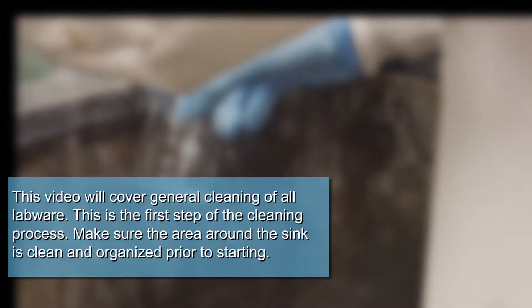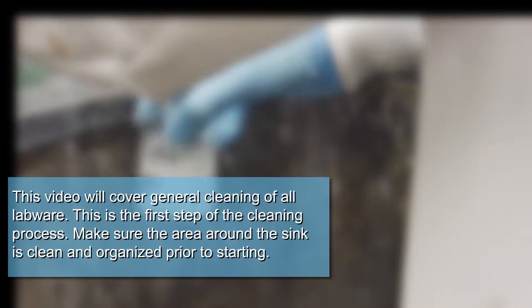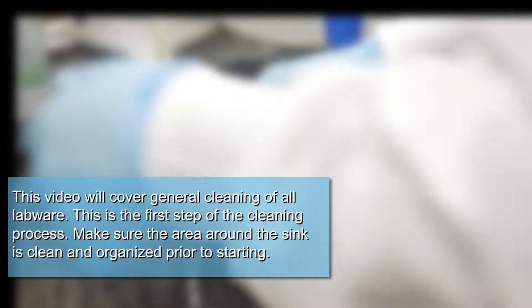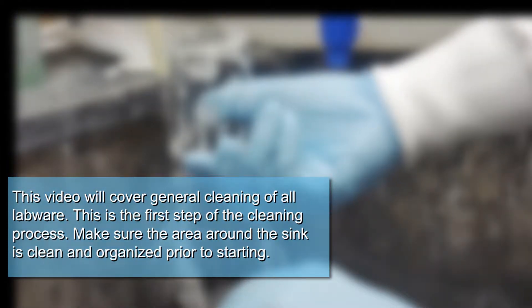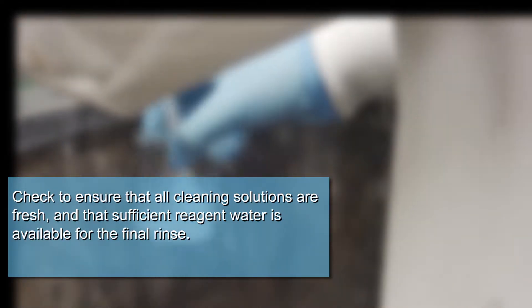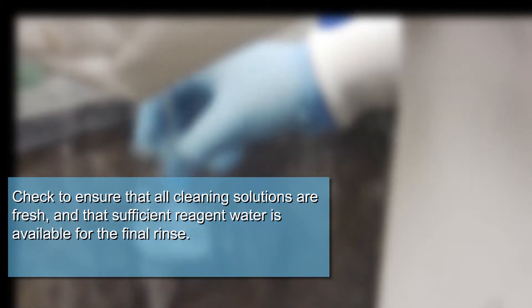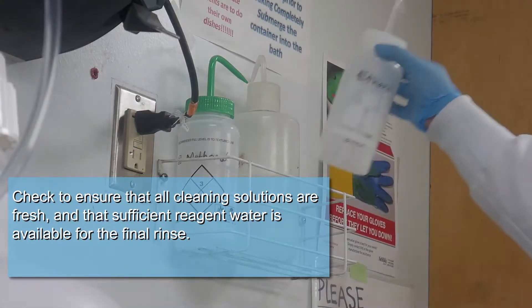This video will cover general cleaning of all labware. This is the first step of the cleaning process. Make sure the area around the sink is clean and organized prior to starting. Check to ensure that all cleaning solutions are fresh and that sufficient reagent water is available for the final rinse.